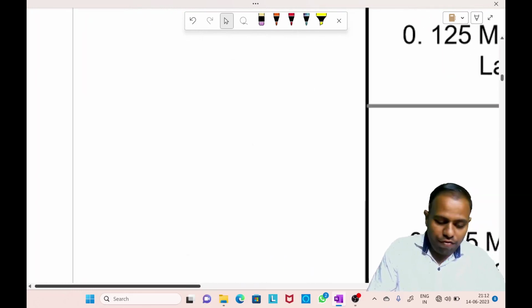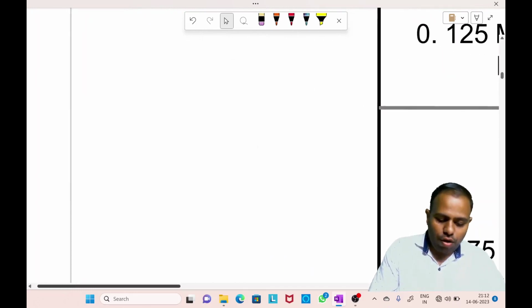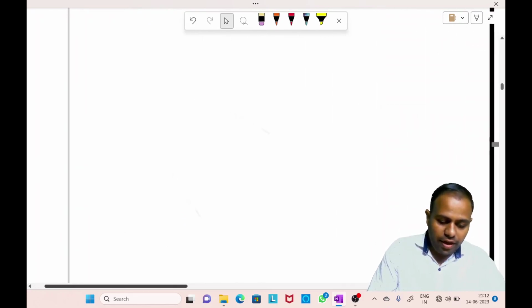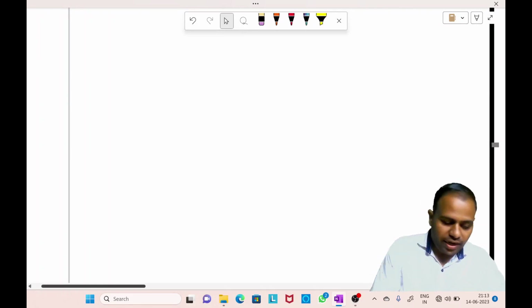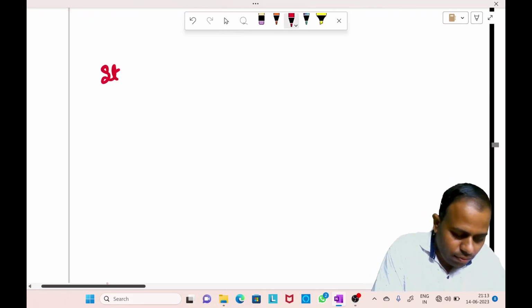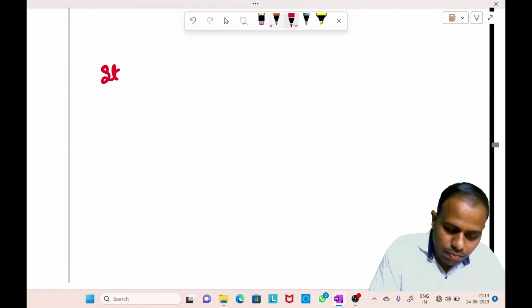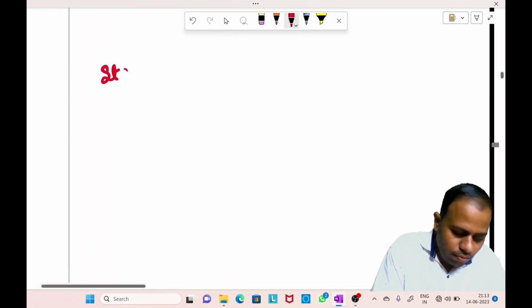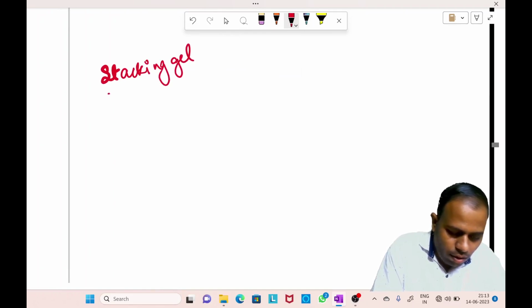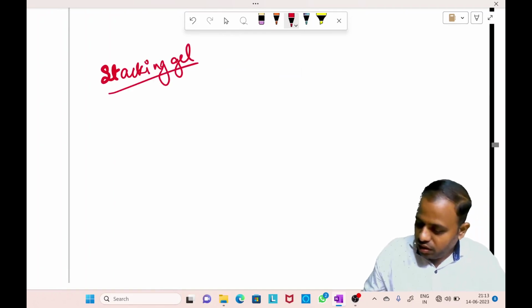First of all, I am giving you the composition of the stacking gel, the upper one. Let's begin with the composition.